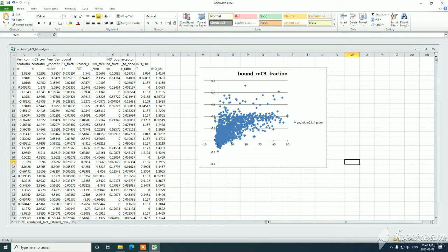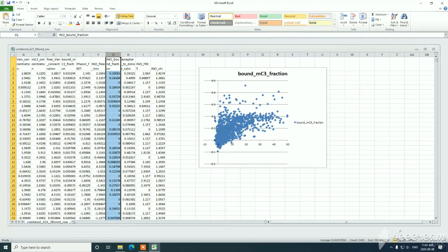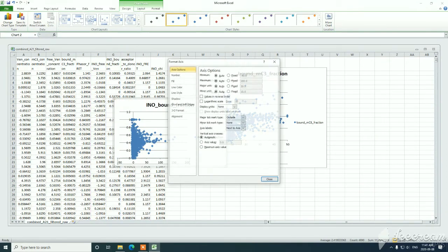In this, you can also see we've calculated the FRET efficiency from the phasor plot analysis, and on the right, we've exported features from the INO FLIM hyperspectral software, which is showing you the bound fraction calculated from the double exponential fit, and you can examine the effect of using different fitting algorithms to calculate bound fraction if desired.